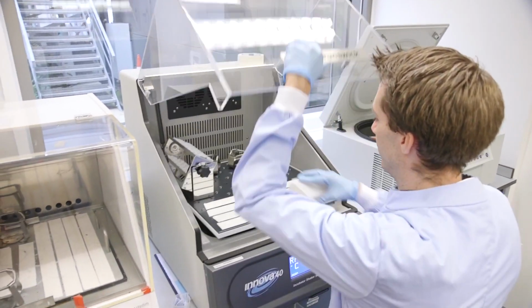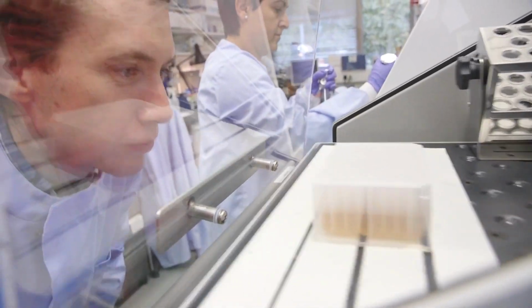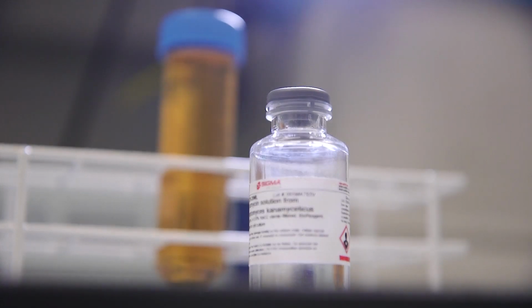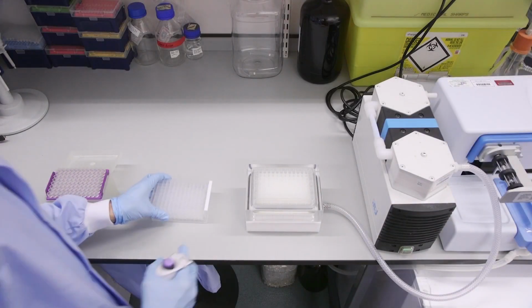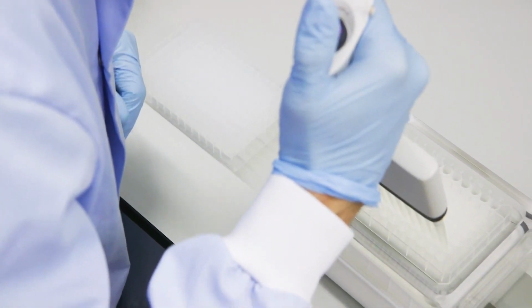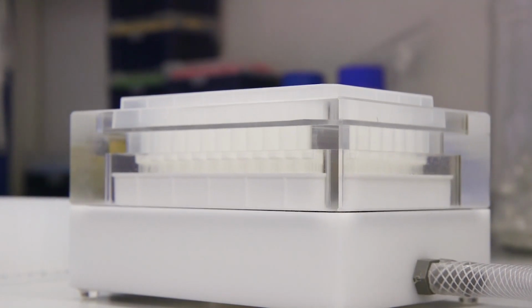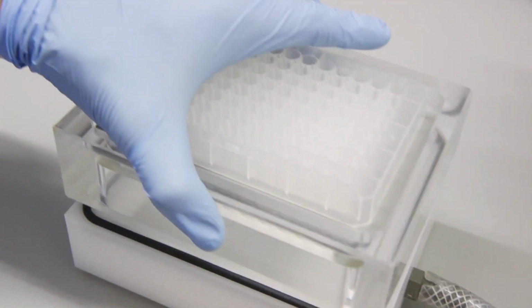Under specific culture conditions, the cells now perform the recombineering reaction, which replaces a piece of malaria DNA with a resistance cassette. When exposed to antibiotics, due to the resistance marker, only the bacterial cells that have performed this reaction correctly will survive. We now need to replace the bacterial resistance genes for a new malaria-specific cassette that will allow us to eventually select for successful vectors in the malaria parasite. For this, we first extract the modified DNA, known as plasmids, from the selected bacteria. We then perform a so-called gateway reaction to swap one cassette for another.